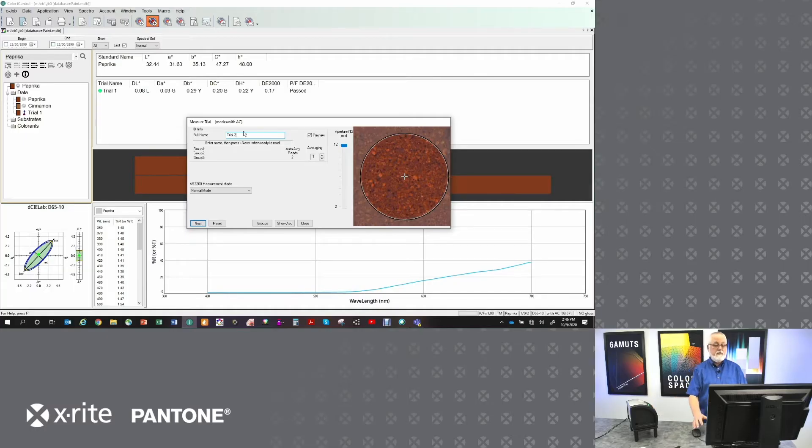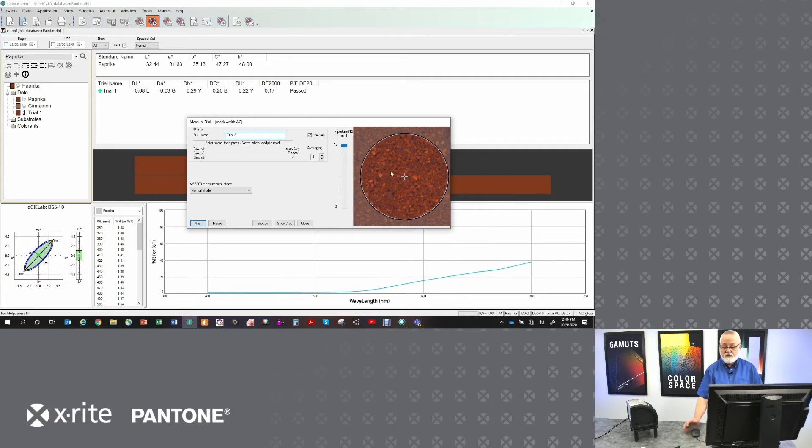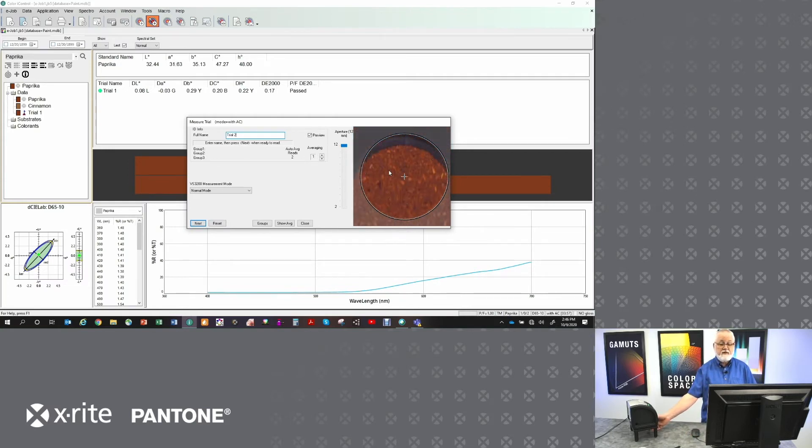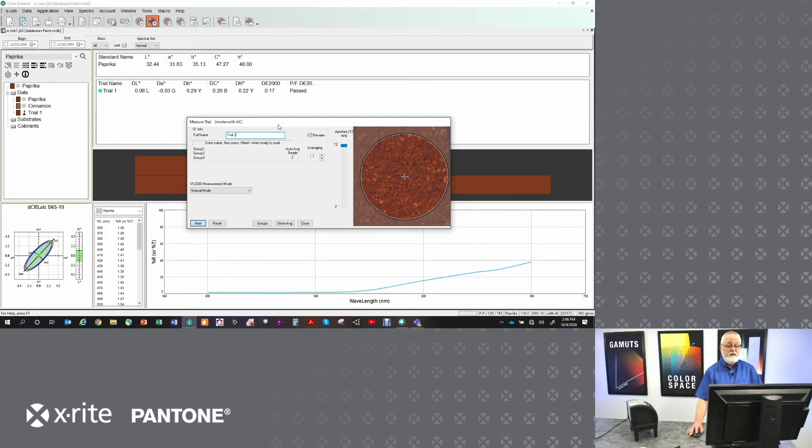So let's come over to the software because in the software I can see, because I have an image-based spectrophotometer, an image of what's going to be measured. In fact, you can see that it's an image by the fact that if I move it, you can actually see me sliding it in and out. So I'm going to slide that to a spot where I'm going to take the measurement.